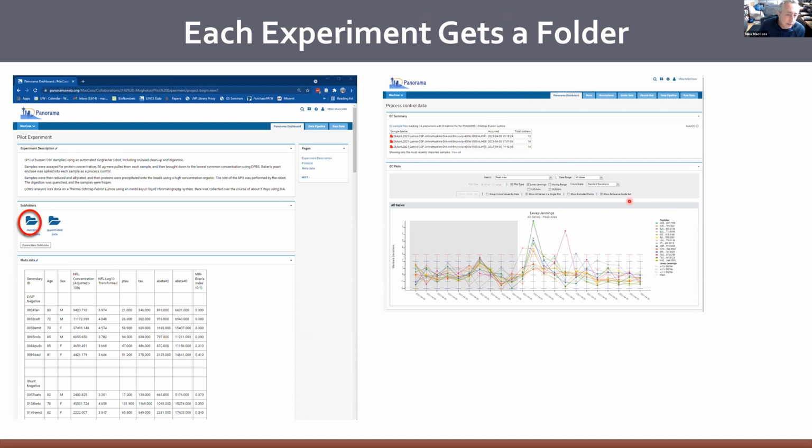And you can see from some of this data that there may be an issue with one sample that occurred on April 29th, and that there's clearly a deviation in some of the peptides relative to the other ones. That allows someone to get this 30,000 feet overview on whether or not something may be wrong with an individual sample, and whether you want to omit it, or whether you want to go in and inspect it in a little more detail.